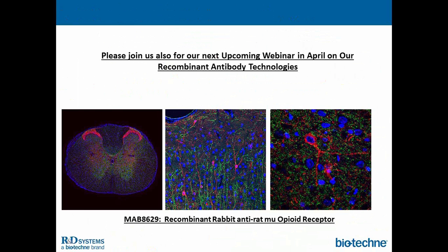That's one way of doing that. Another way is testing a wide variety of cell lines based on mRNA data that is available publicly and making sure that your Western will follow the same expression pattern. However, the difference between mRNA results and protein expression can be there, so it is only one of the options.